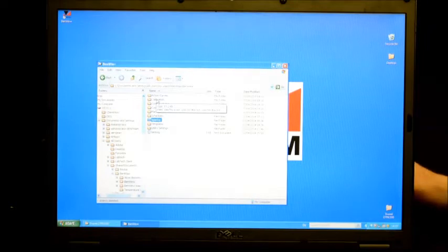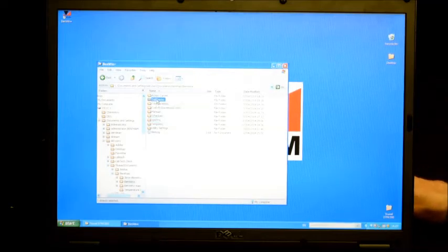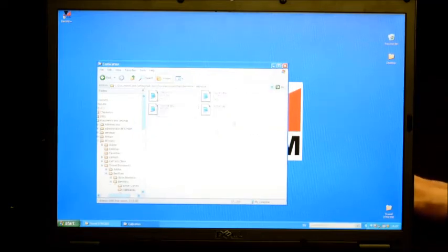One should place the calibration files of any lamps used to calibrate the system in the calibration folder. Those for the CL6 are already included. In the action curves folder are included a number of hazard weighting functions one can add should one wish.